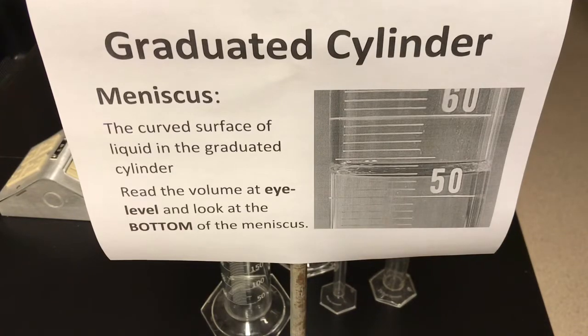In today's video for Grade 9 Advanced Science, we're going to get introduced to a very important piece of laboratory glassware called the graduated cylinder. It's used to measure volumes of liquids very accurately in the lab.